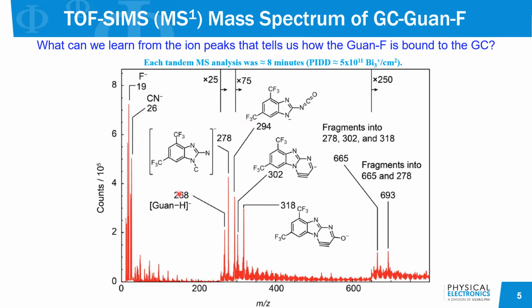So we have focused our attention on identification, both compositional and structural analysis, of these peaks in this mass to charge range. And we have been able to identify the composition and the structure of these peaks, and therefore we can also know the composition of the peaks at higher mass to charge ratio. A couple of examples, I won't go through all the details of all of these peaks, but a couple of them are shown in the following slides.